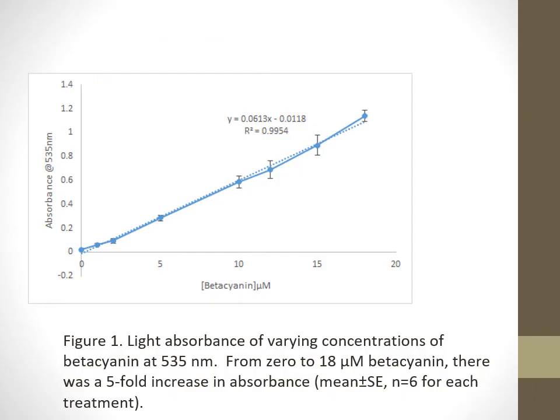So you might build a standard curve that looks like this. You might write a caption underneath it. The other lab you'll be doing online, either before this or after this, depending if you're in group A or B, you'll learn how to make a figure like this. And here's the standard curve. Here's the equation of the line. You can solve for the unknowns using the equation of the line, or you can do it by drawing a line onto your graph.